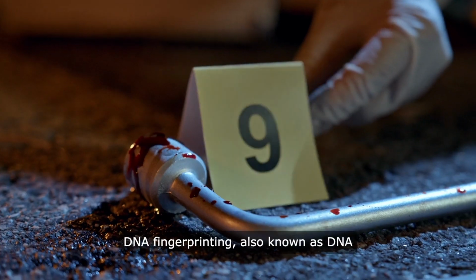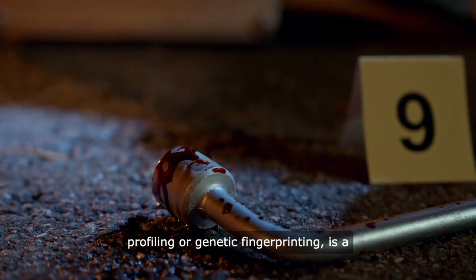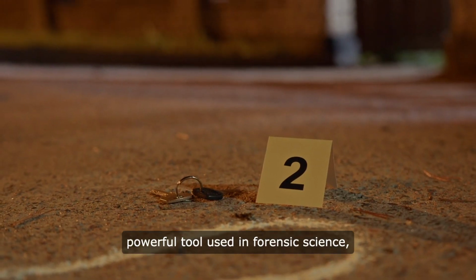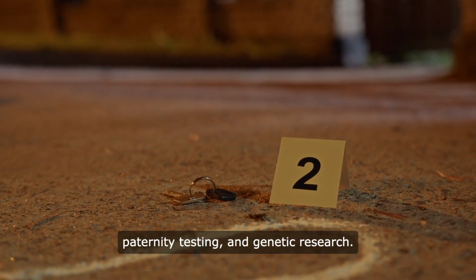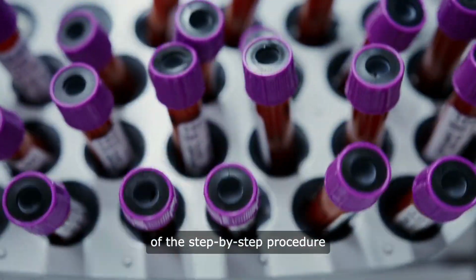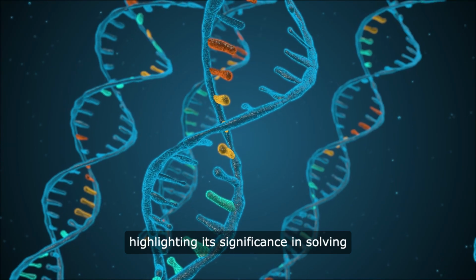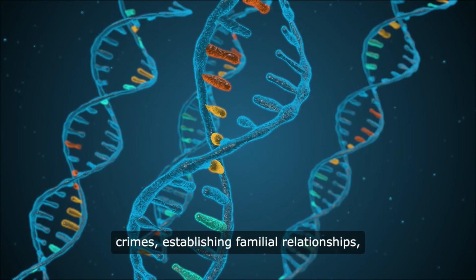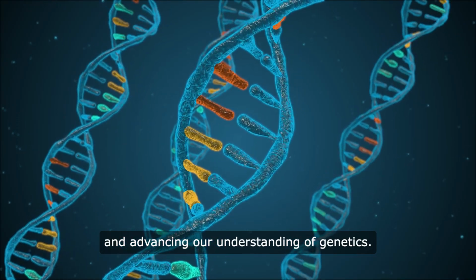Introduction. DNA fingerprinting, also known as DNA profiling or genetic fingerprinting, is a powerful tool used in forensic science, paternity testing, and genetic research. This essay provides an in-depth exploration of the step-by-step procedure involved in DNA fingerprint testing, highlighting its significance in solving crimes, establishing familial relationships, and advancing our understanding of genetics.